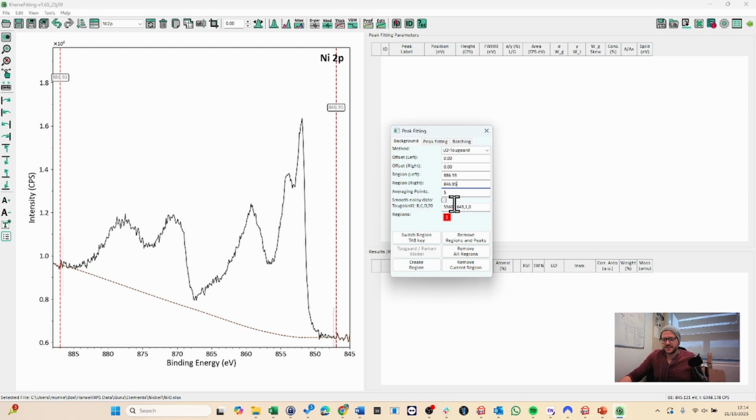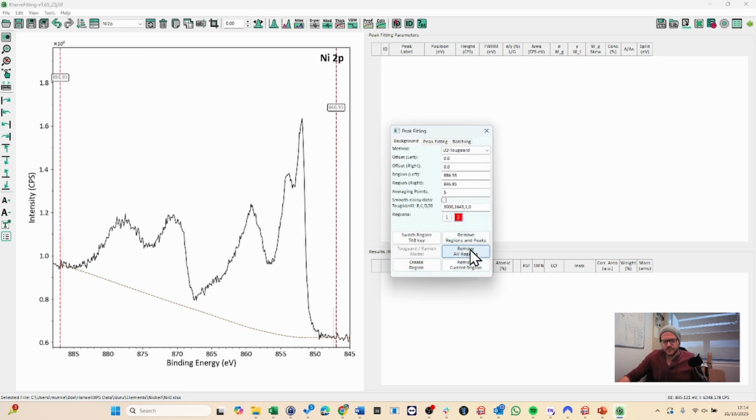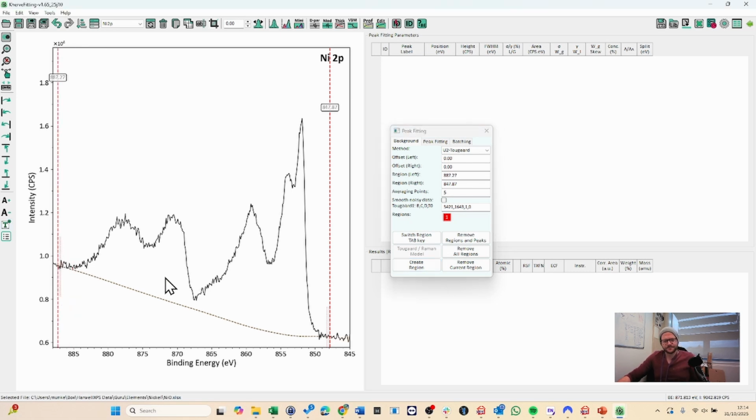You can adjust these parameters here. So let's say, for example, take B down to 3000. Again, if you want a reminder about what these refer to, check out the guru page below. We'll just create a new region here, and what you should be able to see if we remove all regions, create a new region with our new component parameters, we've got a slightly different point at which we're starting to see this loss onset occur.